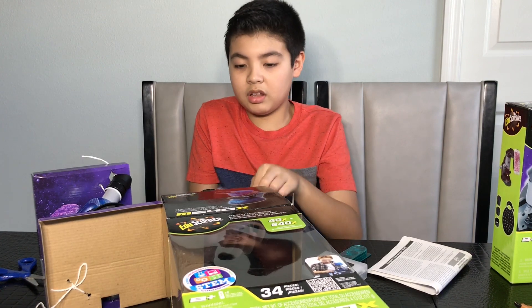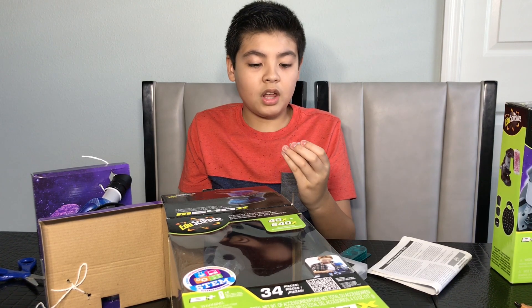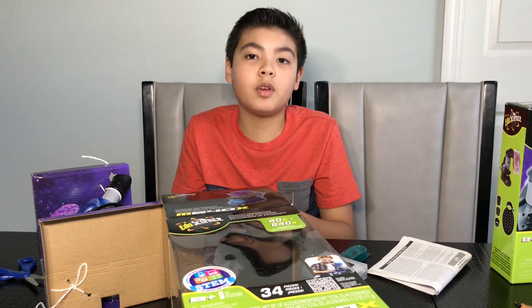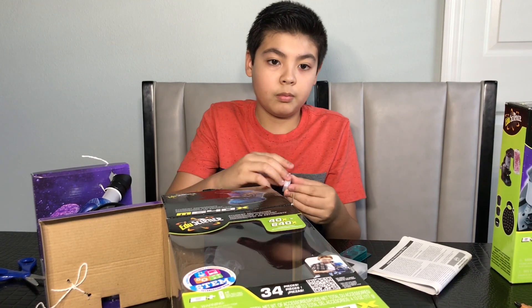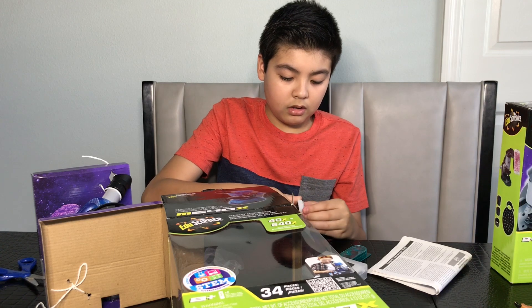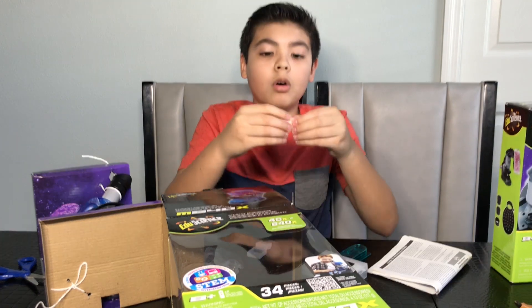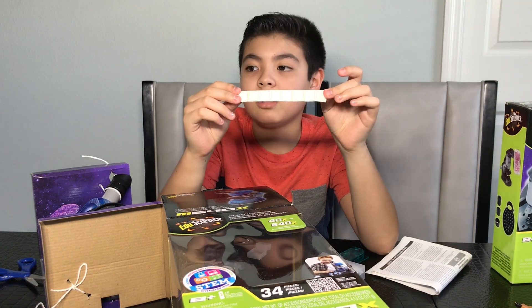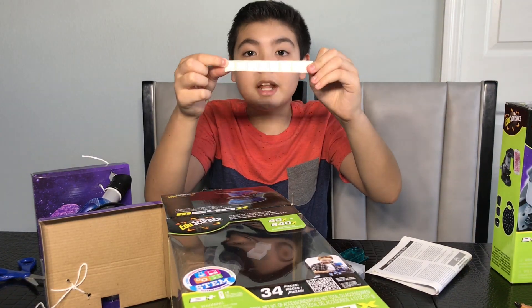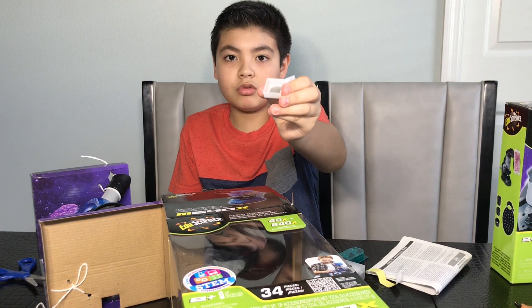These are our slide covers. If you want to know how to make your own slides, I'll tell you — it's very simple. These are your slides and covers. They're very clear, so don't drop these — they're plastic. These things were stuck together because of tape. So this is your label on the slide. Let's say I was looking at a leaf, I can label it. You got eight of them — that's extremely perfect. We got eight slides.